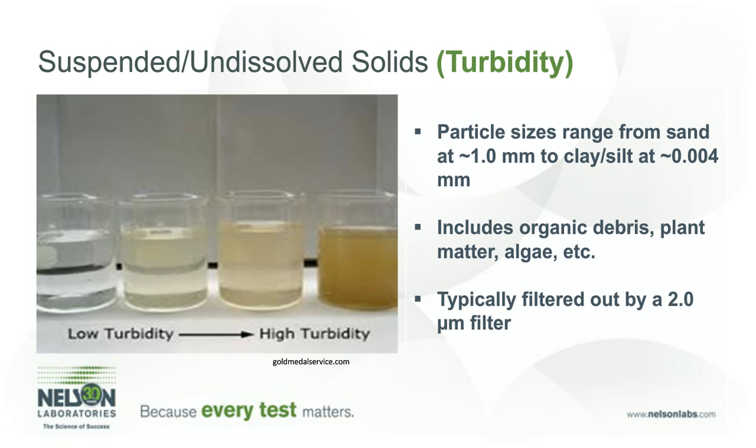Suspended solid particles typically range in size from sand at 1.0 millimeters down to clay and silt at 0.004 millimeters. These particulates will typically not pass through a filter with an active pore size of less than 2 microns, or 0.002 millimeters.